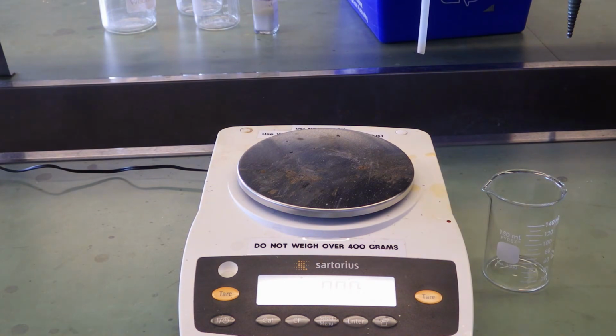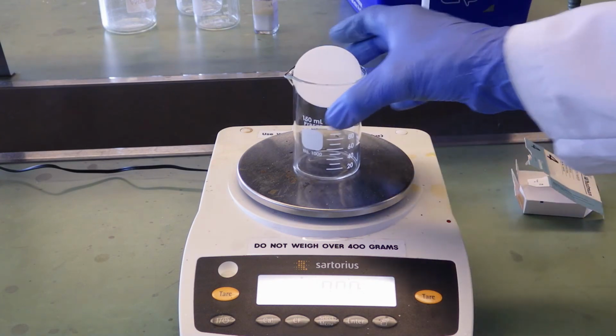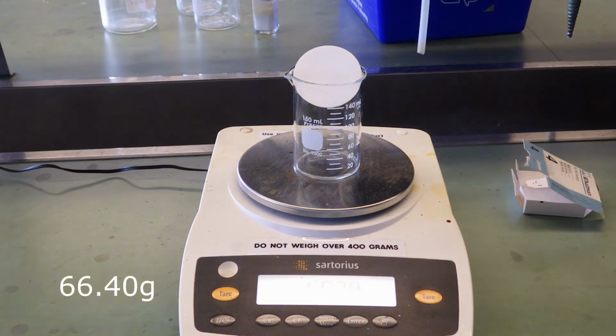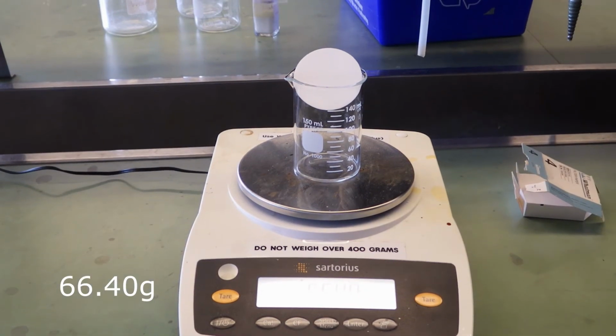Now I see the display on the balance is not showing well on the camera, but I'll read you the mass. It's 66.40 grams. You want to record that.